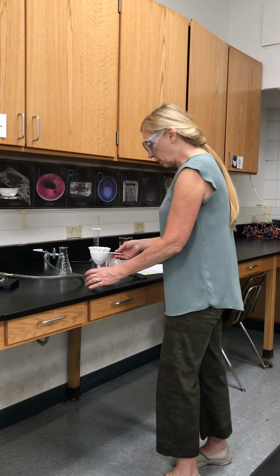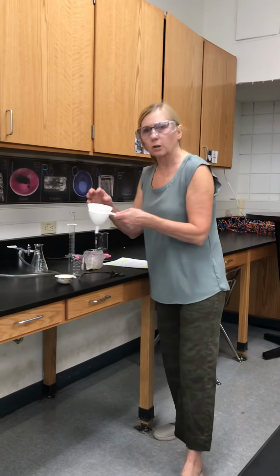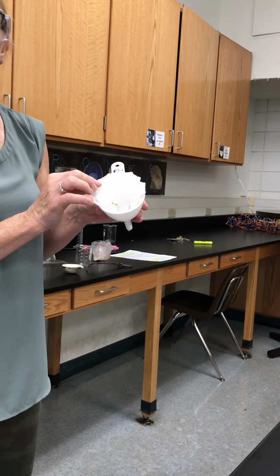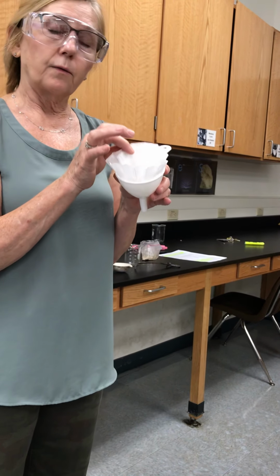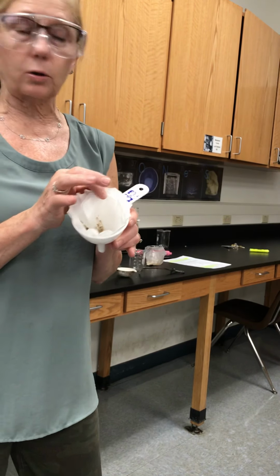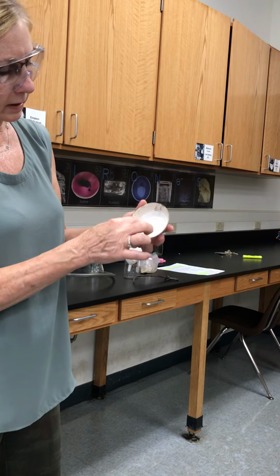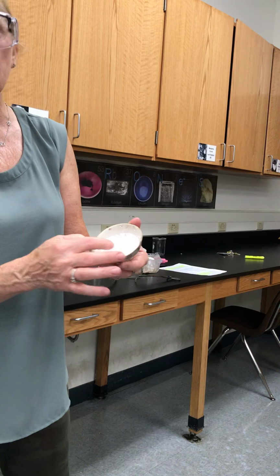If you want to come over and see what we have left in the filter, we examine the filter. What we see inside the filter is just the sand. On your data table, what you should be recording is that what was left in the filter paper is the sand. There's no water left in here. We don't see any salt crystals, just sand. Now, in our evaporating dish, after the water has boiled away, we can see this white crystallized salt.